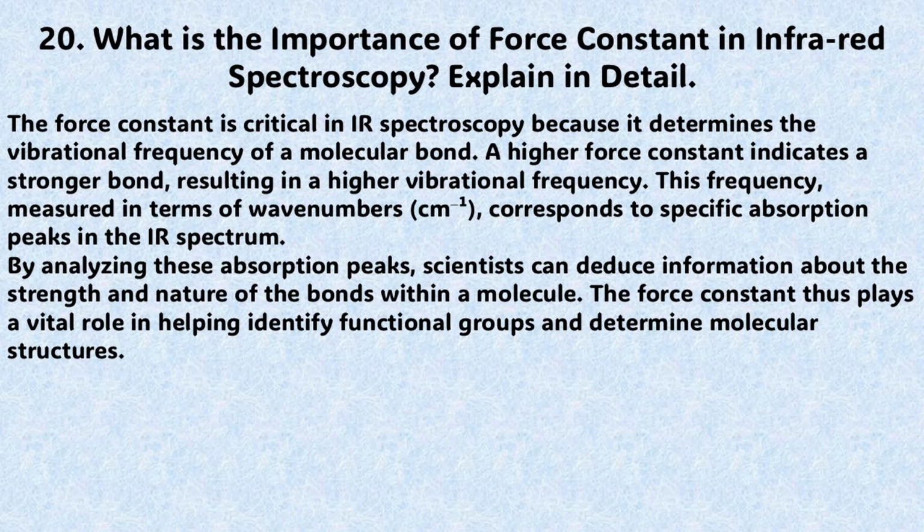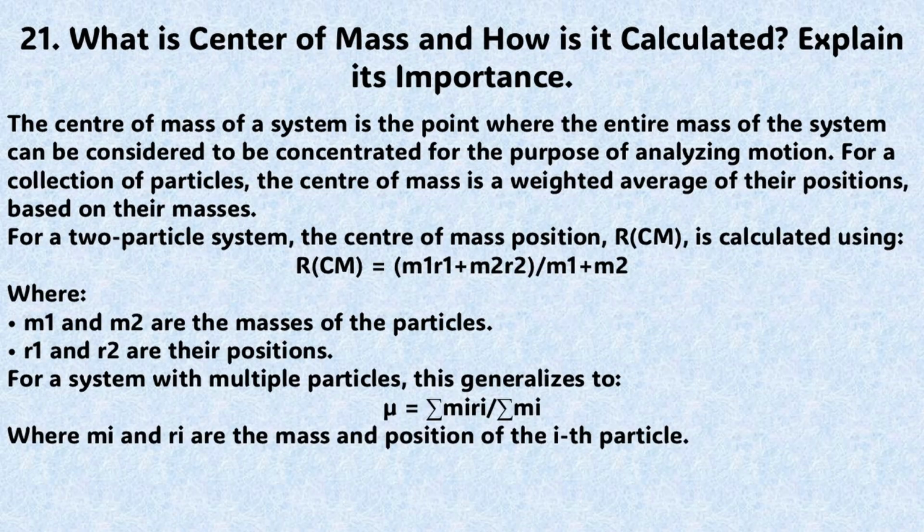This frequency, measured in terms of wave numbers, centimeter inverse, corresponds to specific absorption peaks in the infrared spectrum. By analyzing these absorption peaks, scientists can deduce information about the strength and nature of the bonds within a molecule. The force constant thus plays a vital role in helping identify functional groups and determine molecular structures.